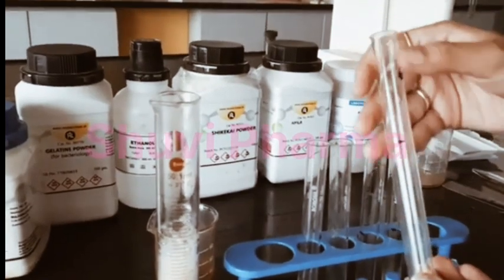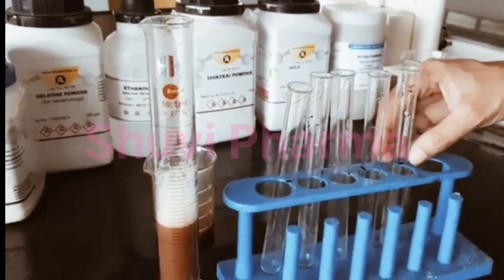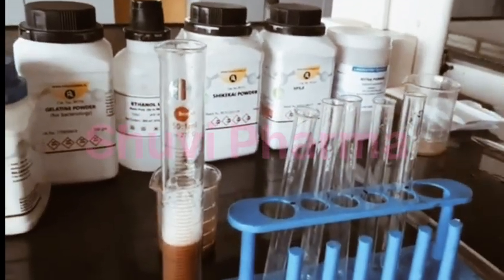So we will add 1 ml in the first test tube, 2 ml in the second, and so on, and 5 ml in the last test tube, and we will make up the volume up to 10 ml. Then we will shake the test tube, and then we will measure the foam by using a scale in centimeter. Now we will perform the evaluation.